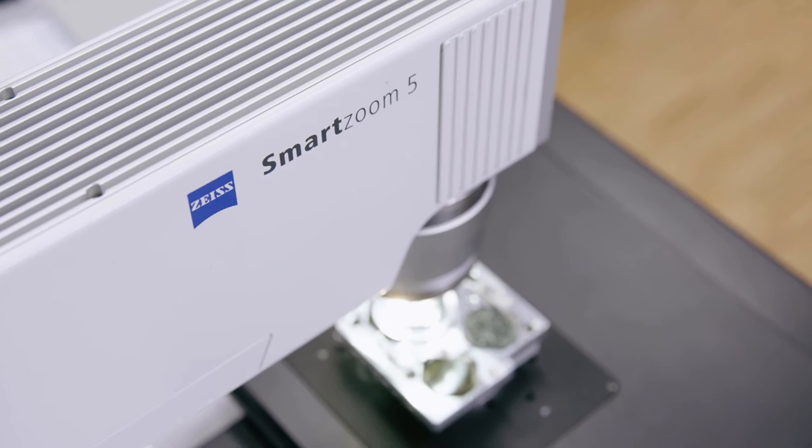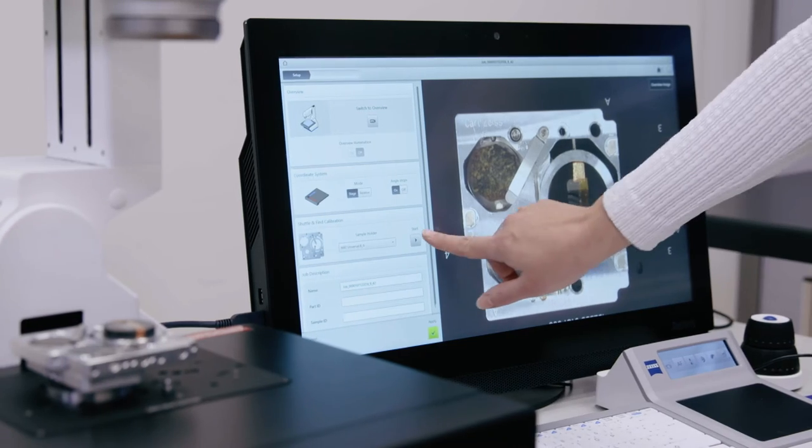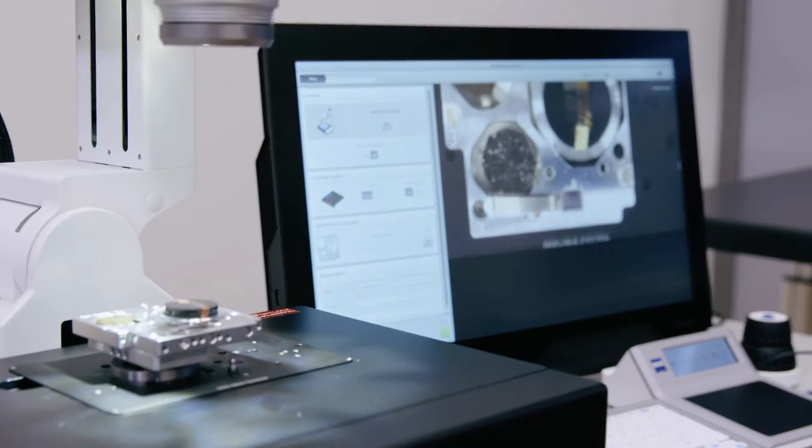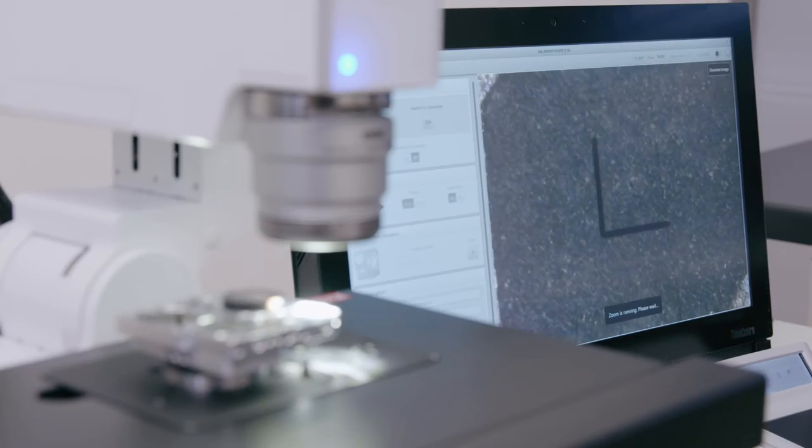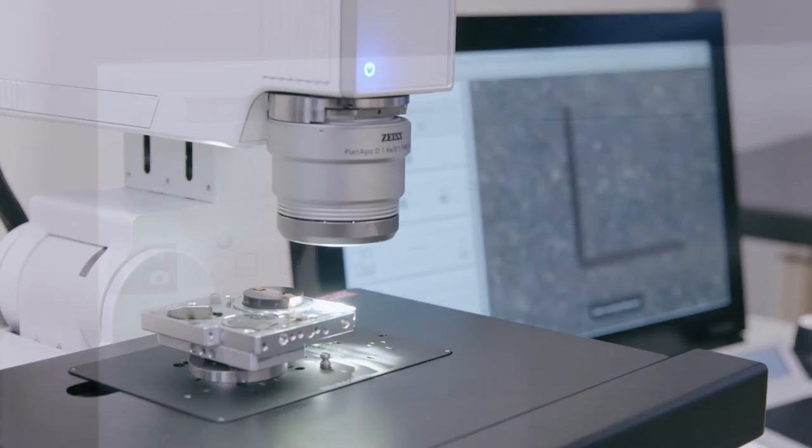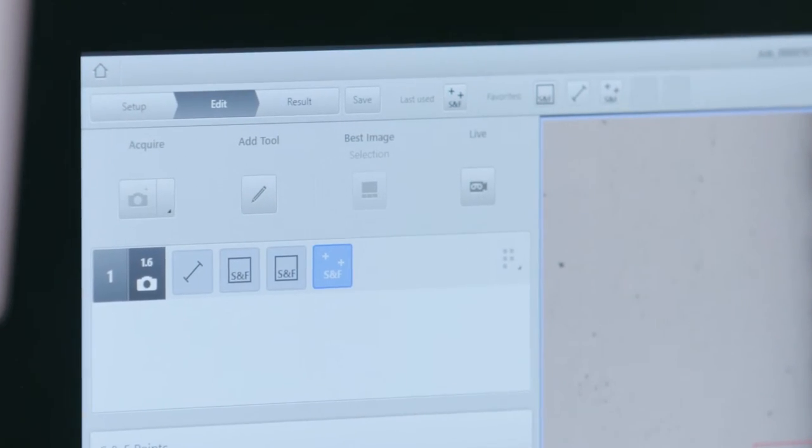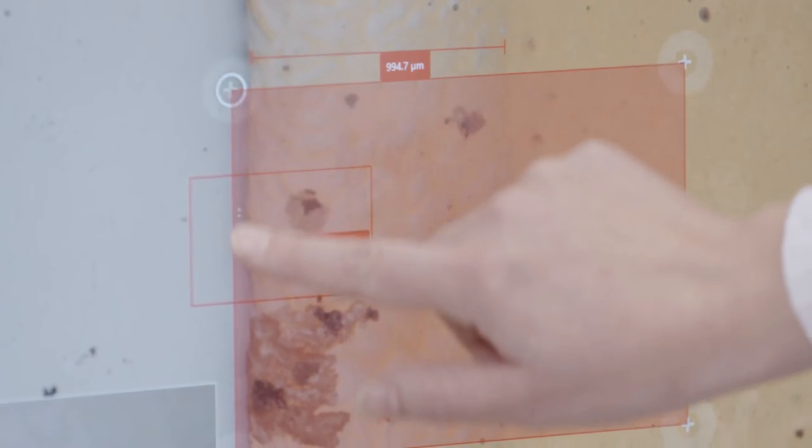The digital light microscope Smart Zoom 5 ensures optimal sample inspection thanks to its macro to detail workflow and smart illumination functions. You can easily examine your sample, and the user-friendly interface helps you define regions of interest with ease.